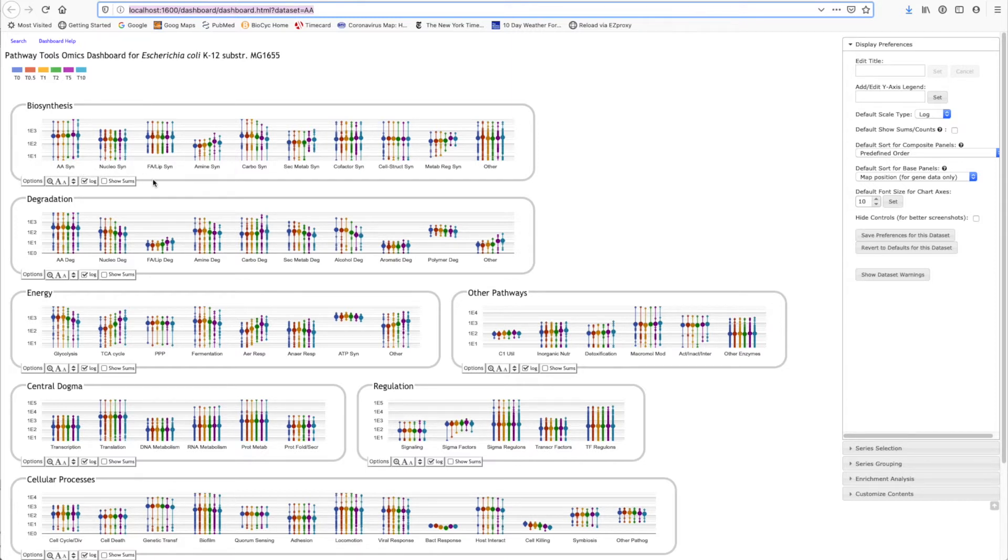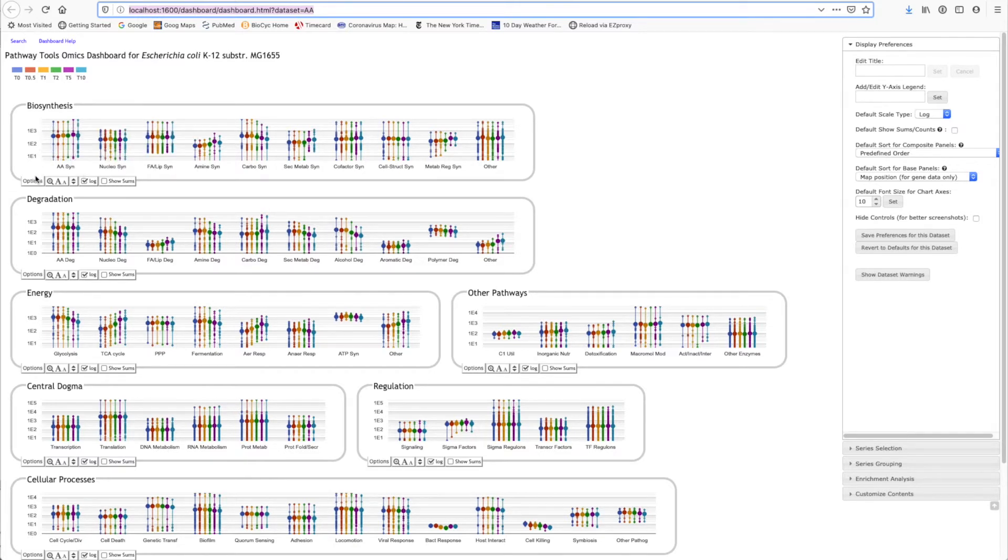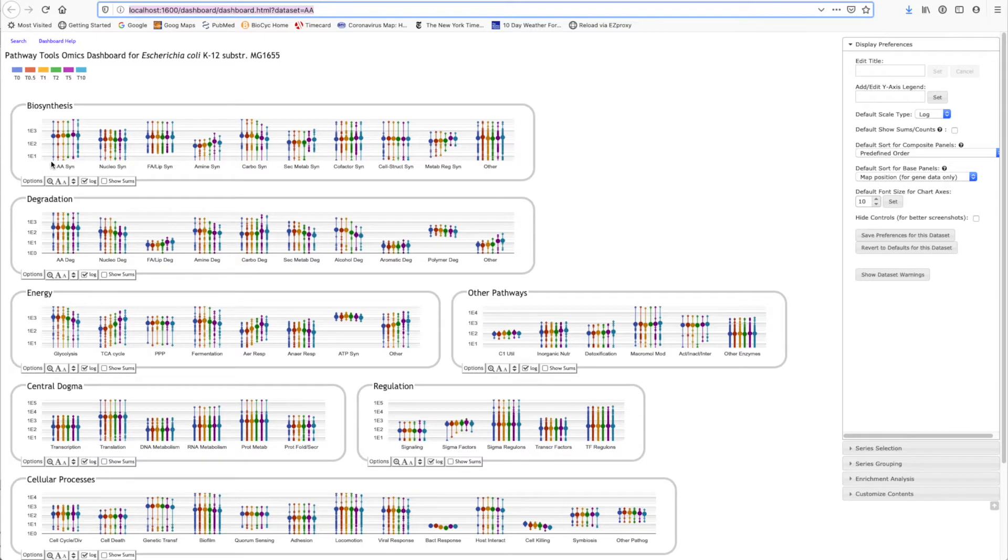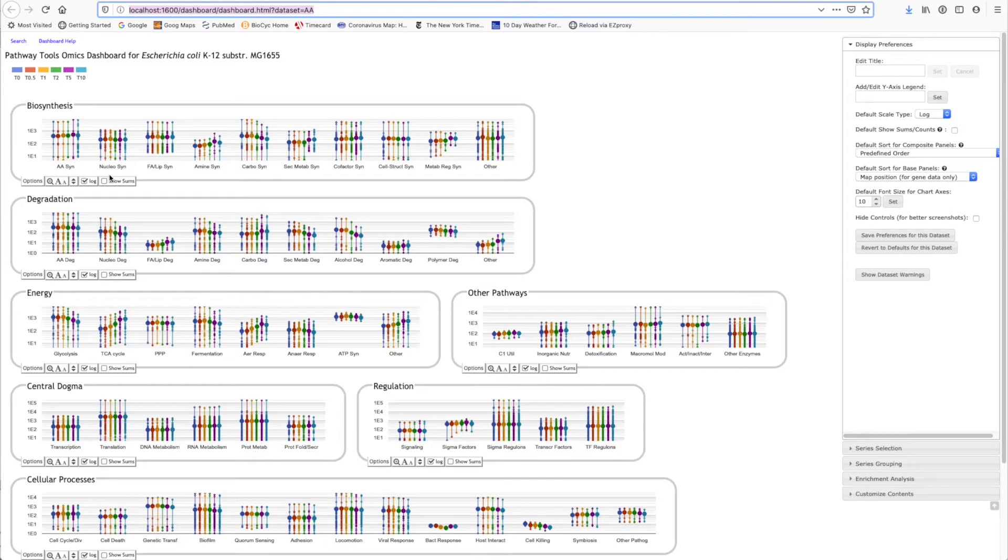The data set that we're looking at is a data set in which E. coli transcriptomics data are gathered at six different time points, hence the six different colored bars here, during the shift from anaerobic to aerobic growth. And what the tool is doing is plotting for the six different time points expression levels for all the genes in amino acid biosynthetic pathways in this plot, and all the genes for nucleotide biosynthesis pathways in this plot.